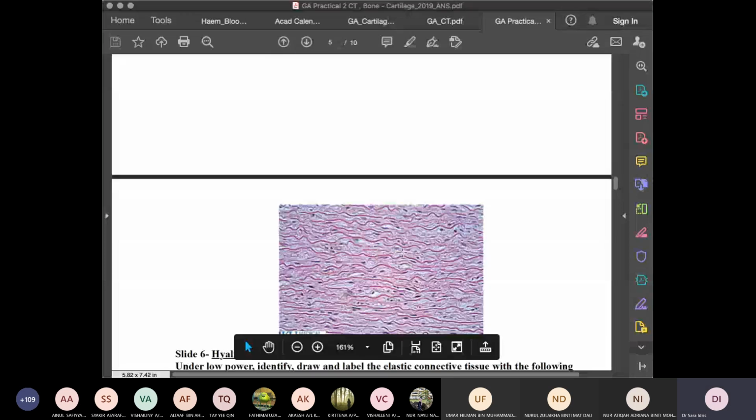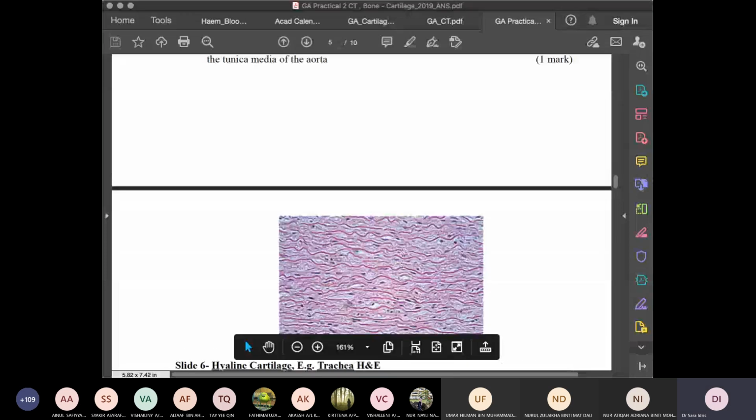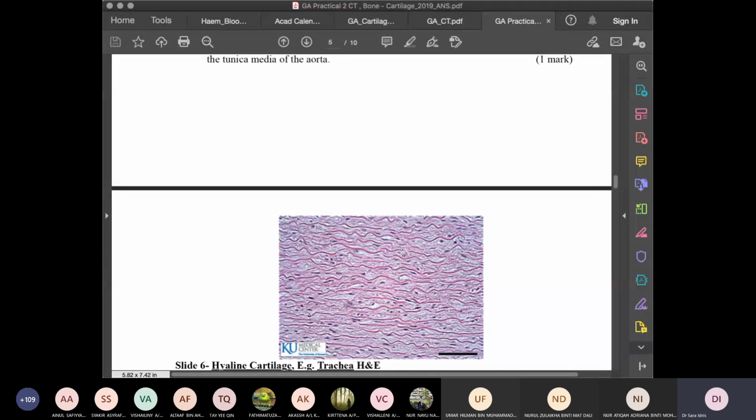Okay. Are you all okay with your proper connective tissue? So we've seen loose connective tissue, dense regular connective tissue, dense regular elastic, dense regular collagenous, and dense irregular. So four slides on connective tissue proper, but we've also got a slide on adipose tissue, adipocytes, to show you what they look like. And there was also a slide that showed you the macrophage, which is a component of connective tissue as well, the one that is fixed. Macrophages can be both.